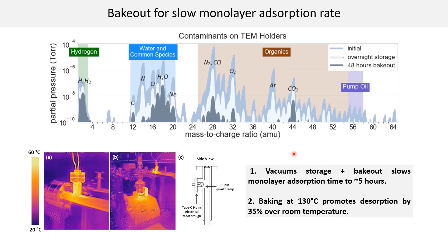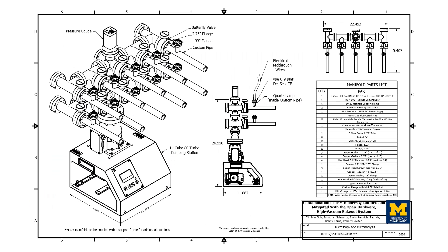We recommend bake-out for any specimen that can withstand moderate levels of heating. According to Boltzmann statistics, the surface molecules can be approximated as a distribution of binding energies. So, by baking at 130 degrees Celsius, we promote a desorption rate by 35% over just room temperature. Even for a specimen that is not so resistant to heating, we can still have it at slightly higher temperature than room temperature, and that would still result in a slightly better desorption rate.